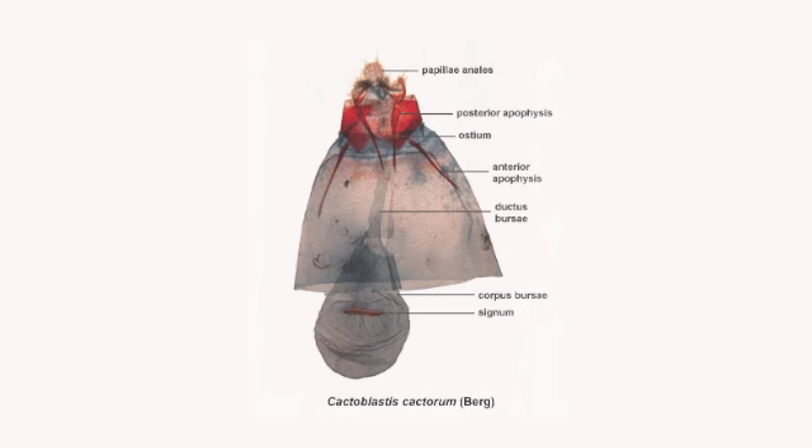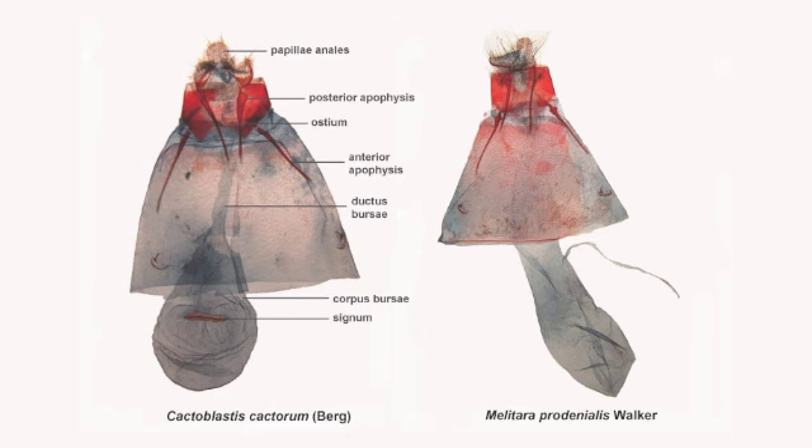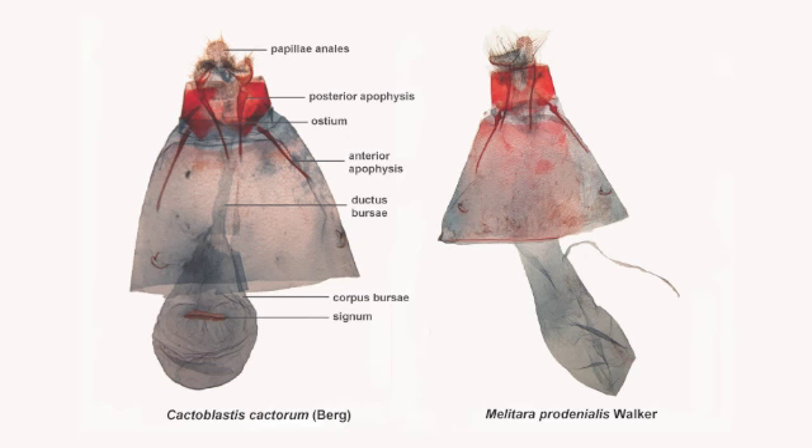The form of the sclerotized signum can be used to differentiate some species. Here we can see the female genitalia of Cactoblastis on the left and the native Melitara prodenialis on the right. Species of Melitara either lack a signum or have a very small, reduced signum compared to the one in Cactoblastis.